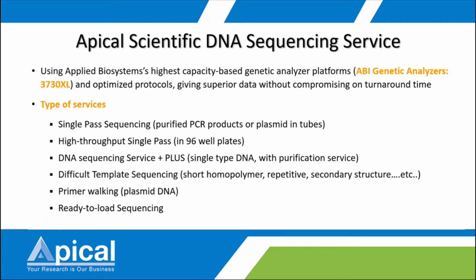And maybe you don't have a purification kit for your PCR product and want to send us unpurified PCR product, yes, you can also. It is under the DNA sequencing plus service. If your sample shows one band, we will perform the PCR product purification directly for you. But if your sample shows two bands, then you may need to help us by cutting the gel, cutting the desired band and sending the gel to us without any solution inside.